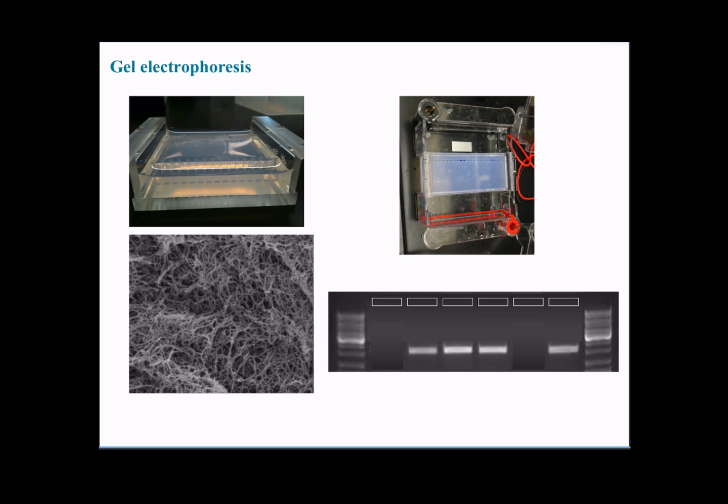So the way this works is the samples run through the gel as far as they could, given their size, and then we subject these gels to a staining with a molecule that will bind to DNA. Wherever it binds DNA, when we hit it with UV light, it will emit some fluorescence light that we can see with special cameras or sometimes even with the naked eye.